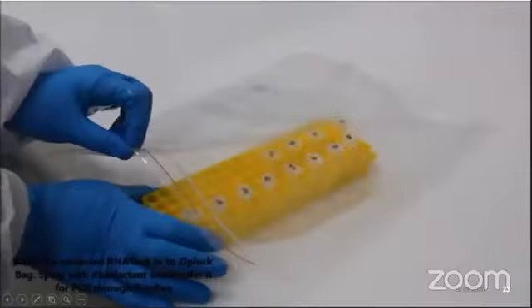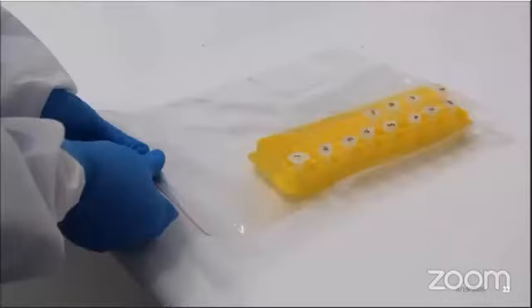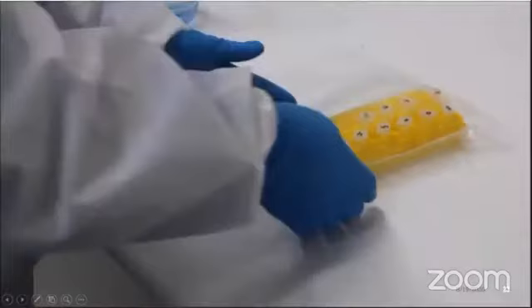Now place the extracted RNA rack into the Ziploc bag and spray the bag with the disinfectant, because this RNA rack in the bag is going out for the RNA RT-PCR through the pass box, which is present inside the facility.